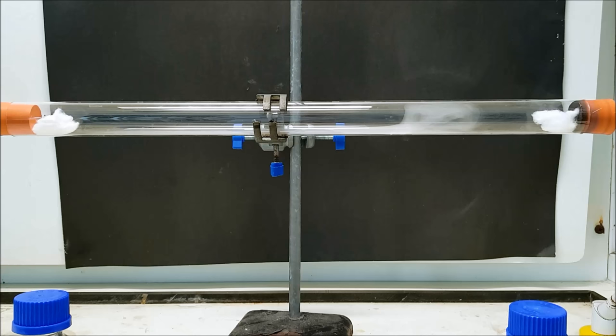What is it? How do you explain the formation of the white solid? How do you explain where it forms?